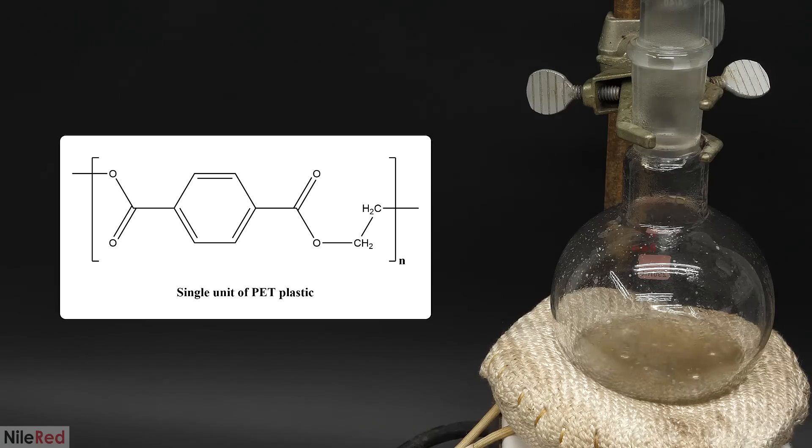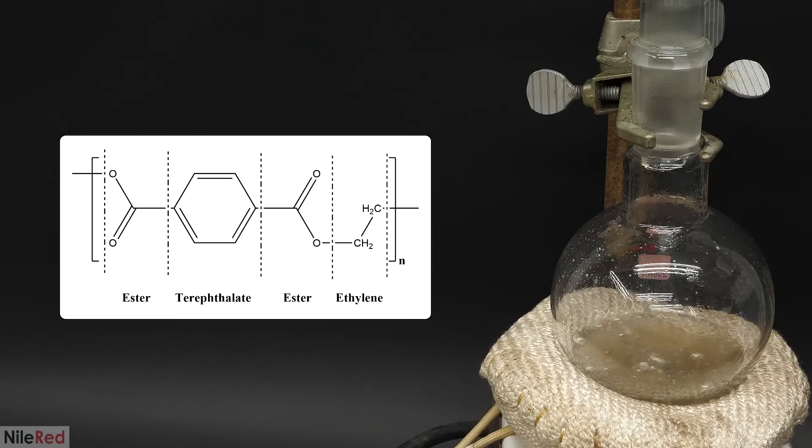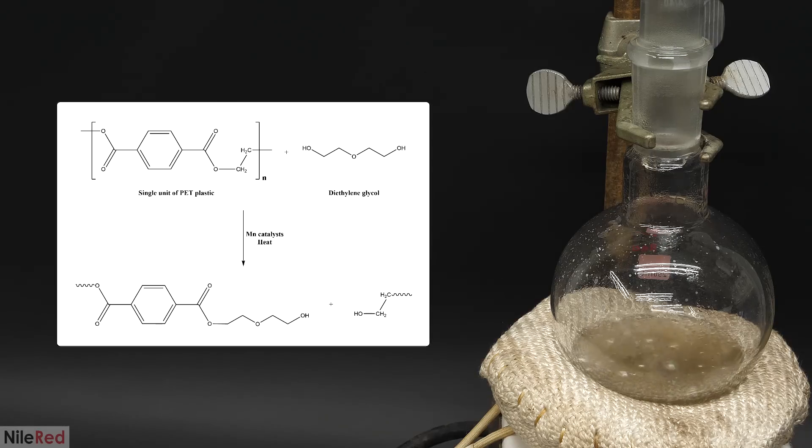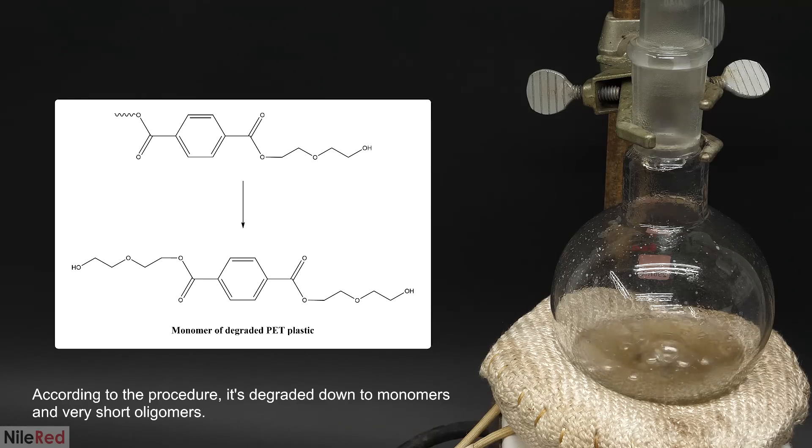PET plastic is a long repeating chain of ethylene glycol and terephthalic acid groups, all bound together by ester bonds. And what I'm doing here is breaking apart this chain, in a process called transesterification. With strong heating, and in the presence of the manganese catalyst, the diethylene glycol starts to attack the PET. It competes with the ethylene glycol for the terephthalic acid, and it's able to kick it out and replace it. This makes a new ester bond between the terephthalic acid and the diethylene glycol, and the PET chain is broken at this point. As the reaction continues, this happens in more and more places, and the polymer is slowly degraded.